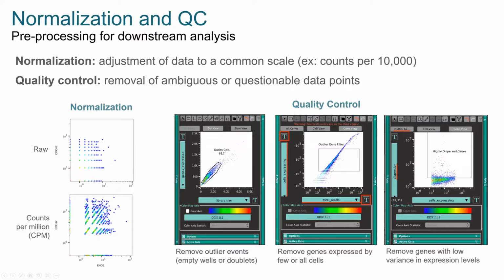That are a lot upregulated or a lot downregulated, right? Because that's what we're ultimately looking for, is changes that are going to help us define subsets of populations within our sample. Okay, so we're going to capture the ones that have high dispersion or basically high variability. Okay. So this is just some pre-processing before we move into our analysis.